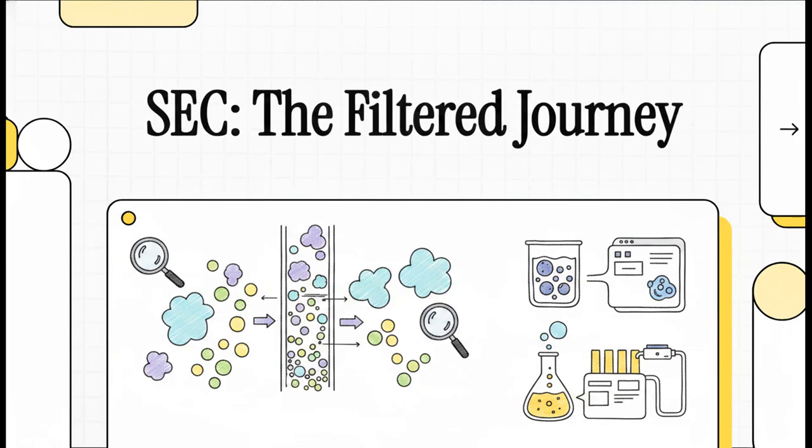Hey everyone, let's jump right into this explainer and uncover how scientists conquer the totally chaotic world of macromolecules. We're talking about size exclusion chromatography, or SEC for short. If you've ever wondered how researchers manage to take a complex biological sample or some messy industrial synthetic mixture and neatly sort out the massive molecules from the tiny ones, you're in the right place. Today, we're going to break down the fascinating mechanics of this technique, but more importantly, zoom in on its specific domains of application.